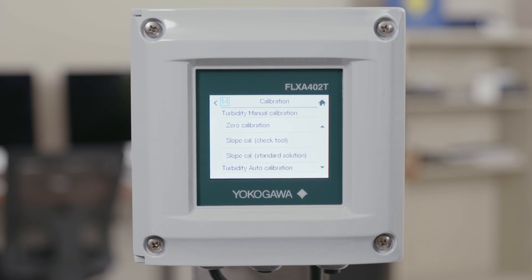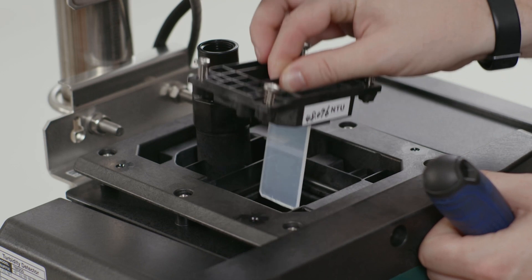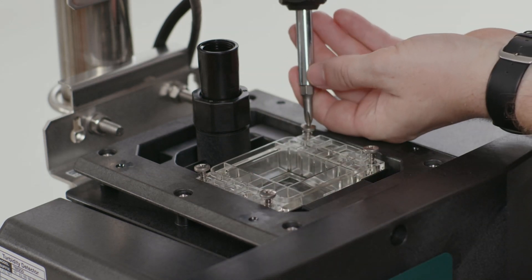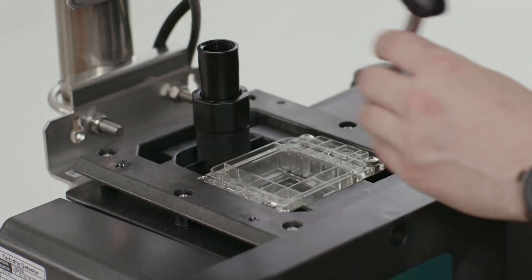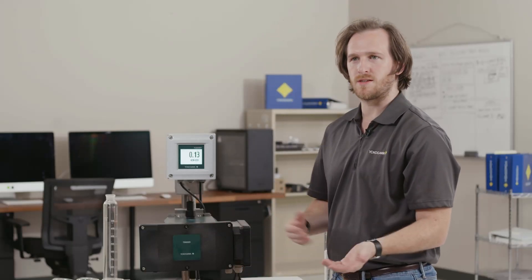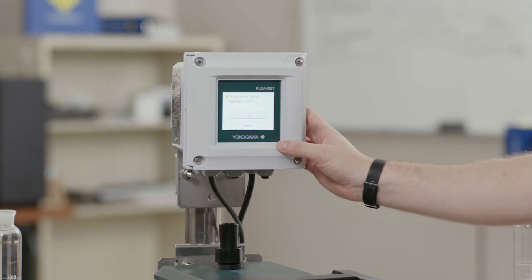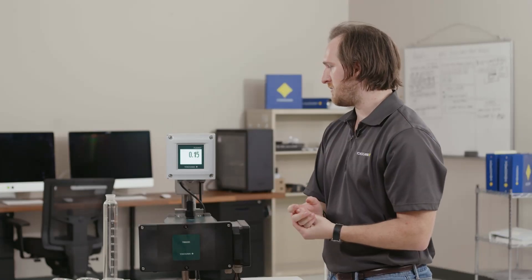Now that we have done a zero and span calibration, drain the zero water out of the analyzer, close the drain, take the check tool out, and replace it with the clear window. Tighten this window down snugly using a crisscross pattern — like you do for your car tire — because this will hold pressure if you have pressure in your system. Once tightened, replace the green cover, then open your inlet and outlet and start flowing process through your analyzer. Once your process has been running for a period of time and your NTU value is stable and any bubbles have left the analyzer, take it out of maintenance mode by clicking the maintenance button on the home screen and confirming yes. Your analyzer is now fully calibrated and reading correctly.